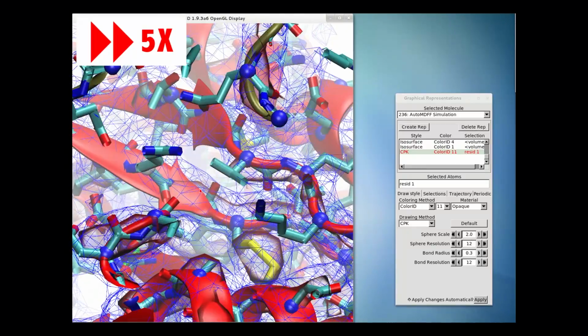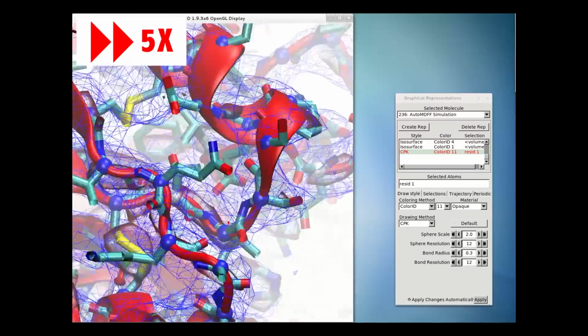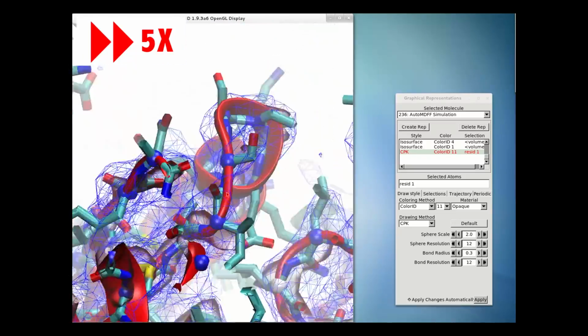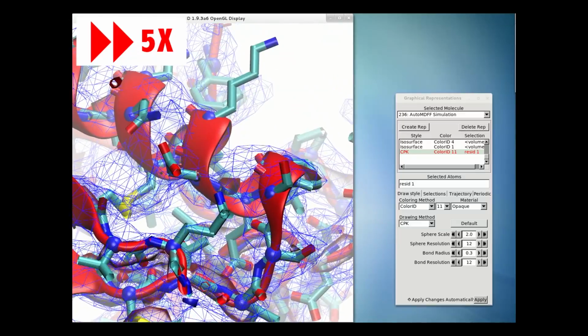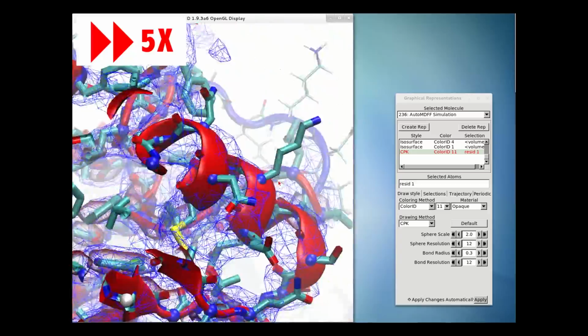To work all the way through this 683 residue structure like this takes the better part of an hour, so I'll spare you the details and skip ahead. The final segment coming up was recorded on my laptop at home, so forgive me the slight change in format.